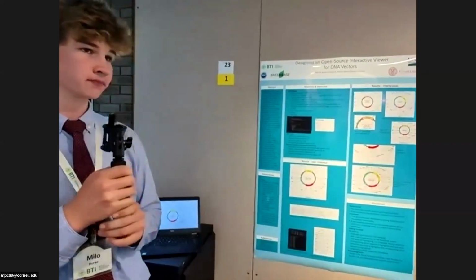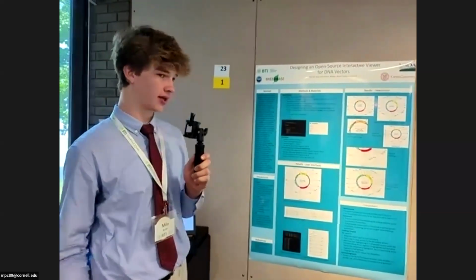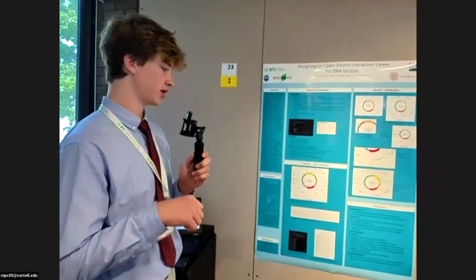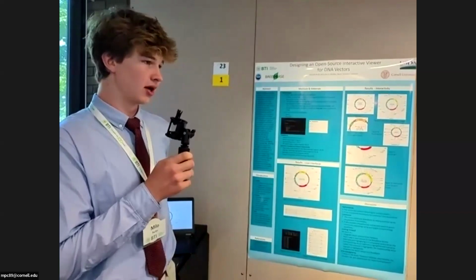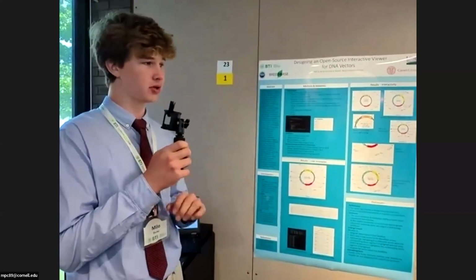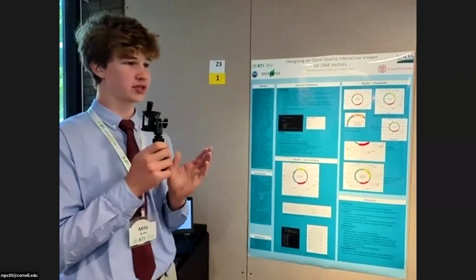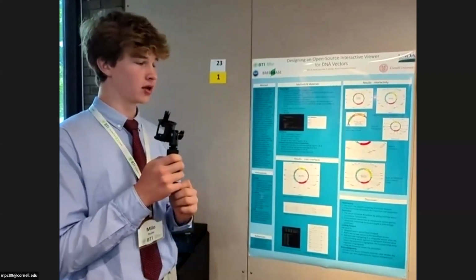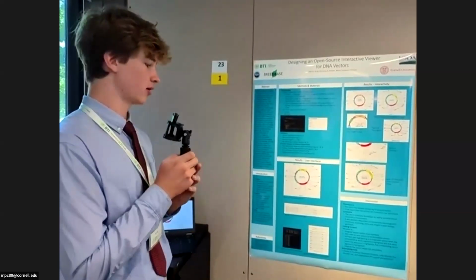So looking forward, we want to be able to integrate data from GenBank into BreedBase, and specifically the vector viewer. We also want to be able to save vectors to the BreedBase servers. Another feature that we would like to add is adding a collapsible section where you can read the whole sequence, and whenever part of the vector is highlighted, the corresponding sequence is highlighted, and whenever part of the sequence is highlighted, the corresponding vector segment is highlighted.